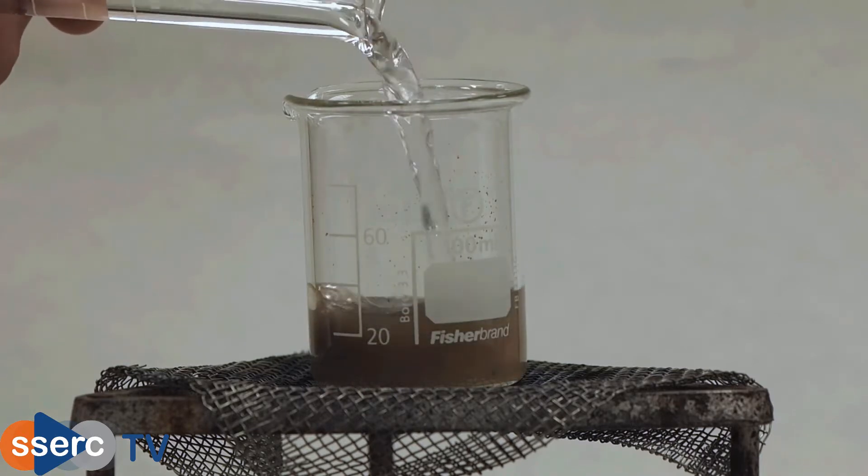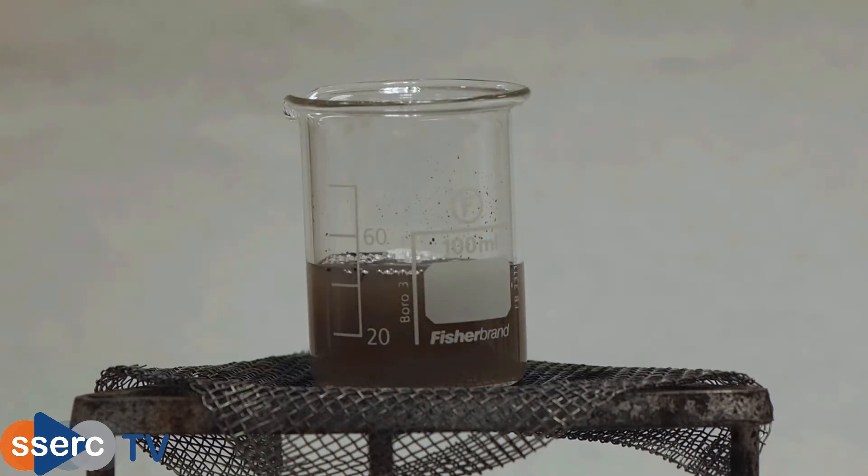In preparation, you need to ash, i.e. burn, a known mass of the food. We have ashed two grams of tea leaves for you. Now we need to extract the iron from the ash residue.